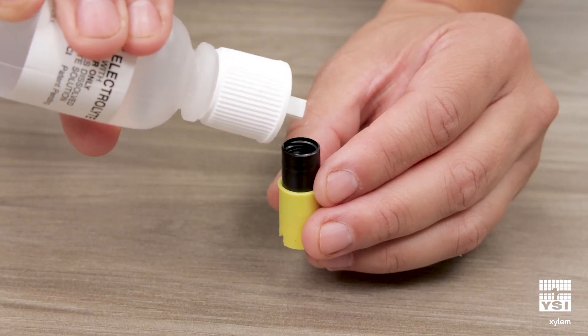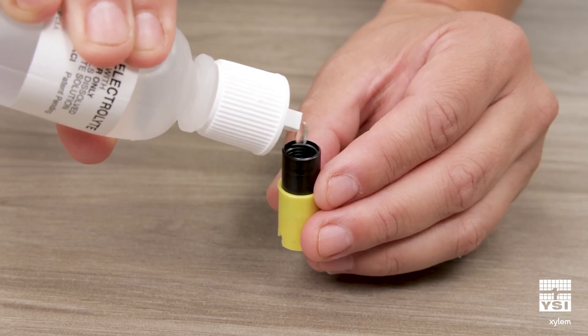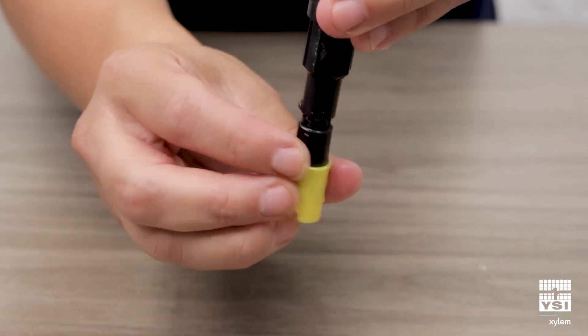Fill the new membrane cap to the top with your prepared electrolyte solution. Be very careful not to touch the membrane surface. Screw your new membrane cap onto the probe. You should see some electrolyte solution overflow.